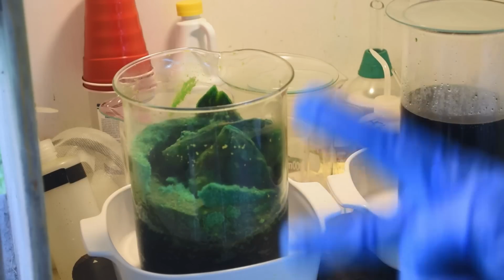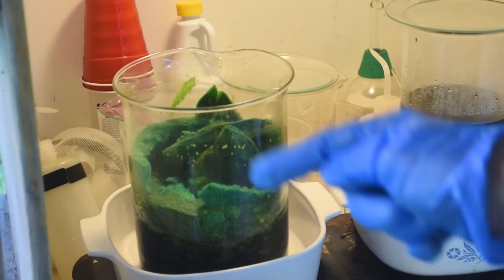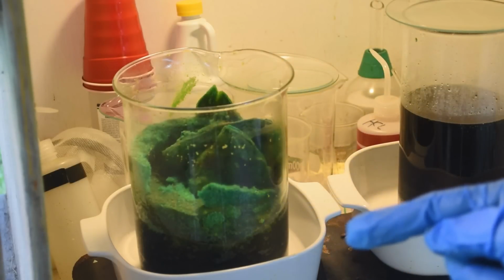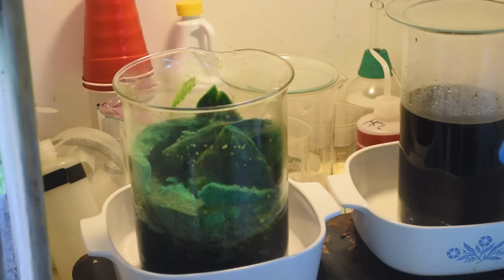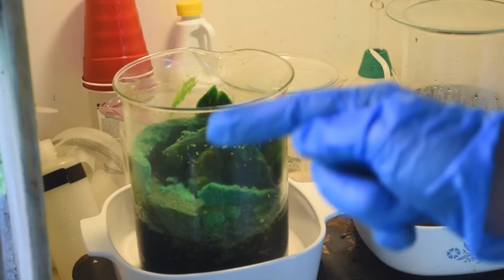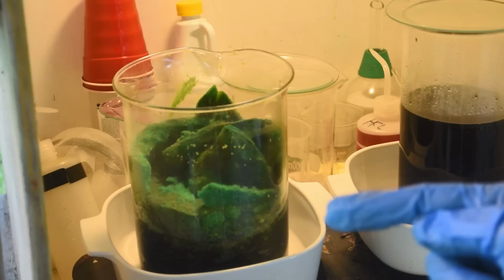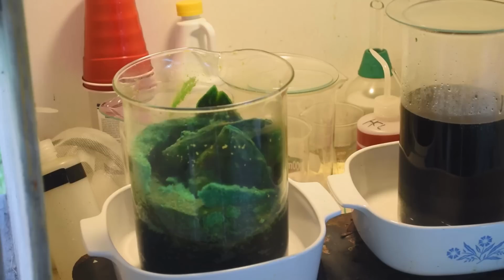So, I mean, I've got two different possibilities here. I could either add more hydrochloric acid to it and try to wash out more of the palladium chloride and dump it over here. Or I could try adding water to this and try dissolving some of these solids away. And that should leave behind palladium chloride as a solid. So those are two possibilities. And I'm just sort of racking my brain figuring out what I want to do. I might have lunch and think about it.